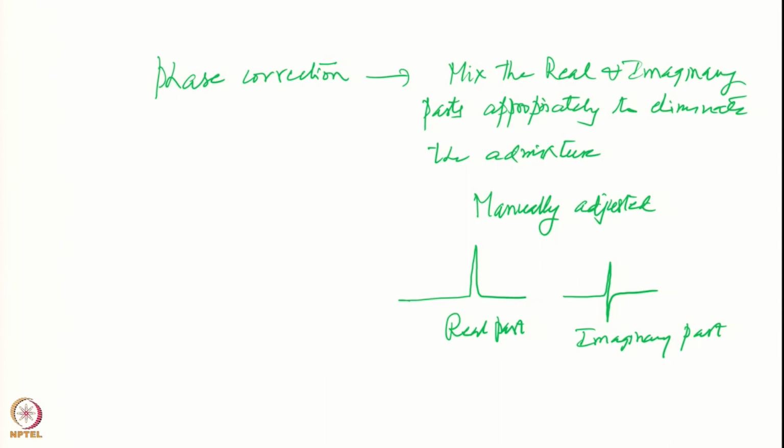The imaginary part stays in the computer, but you do not really look at that. However, it is used for phase correction. So that is the important part of Fourier transform NMR, and this does not exist in conventional spectroscopy. Okay. So now moving on to the next important concept, and that is dynamic range.